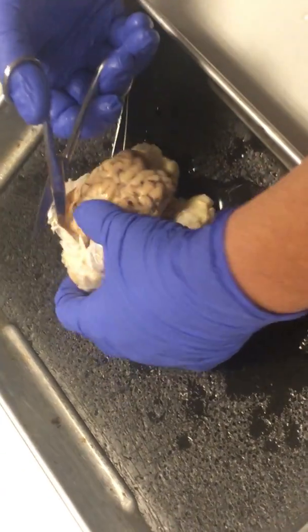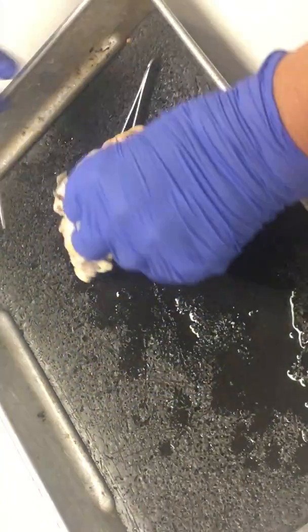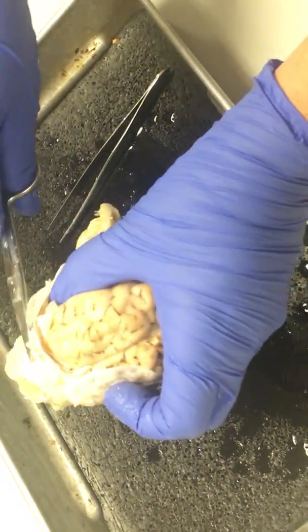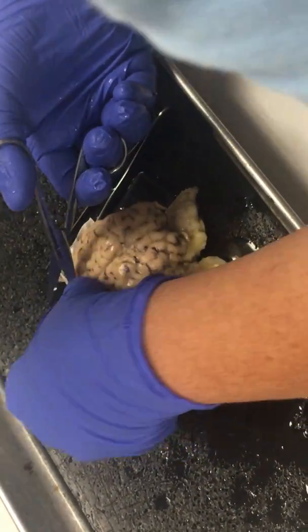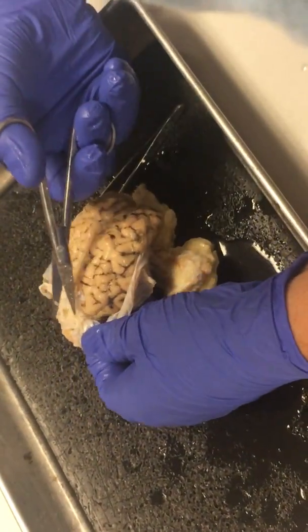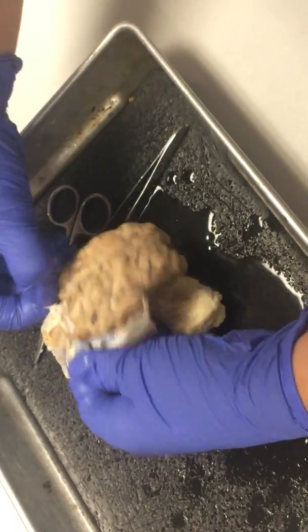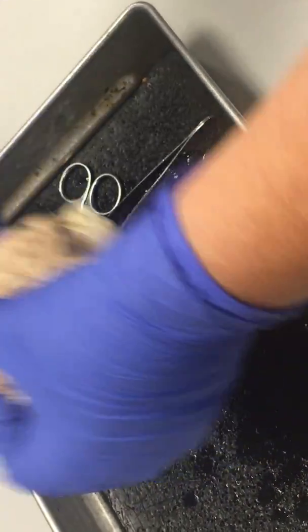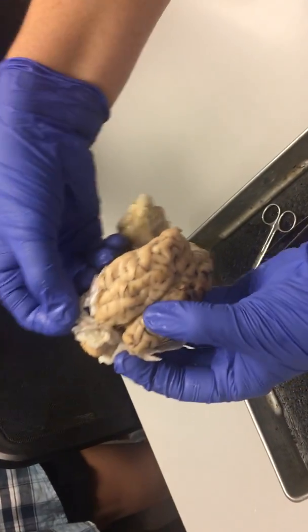There's the dura mater. Right now I'm cutting through that confluence of sinuses. And then this line back here is where the tentorium cerebelli starts. You can see this area right here is really thick because that's the area where the confluence of sinuses and the tentorium cerebelli, the falx cerebelli and the falx cerebri, where they all come together. That's what I'm cutting through right here.